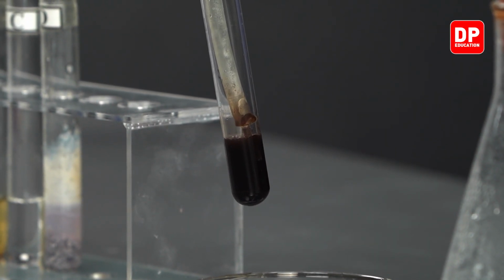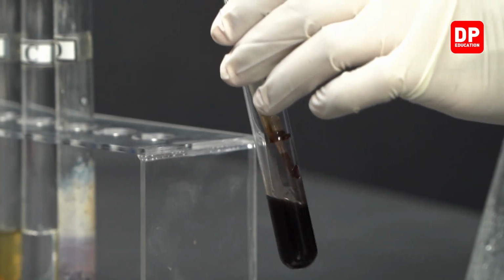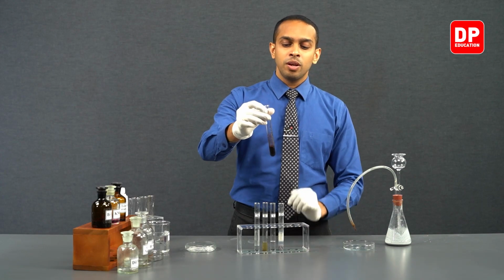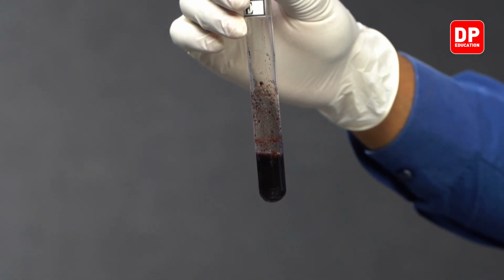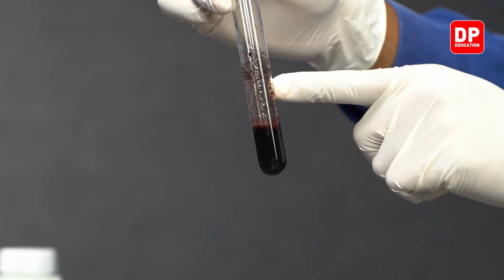It is now somewhat reddish in color. Now students, you can see when we reacted ethine or acetylene gas with ammoniacal cuprous chloride, we can see the formation of a reddish precipitate.